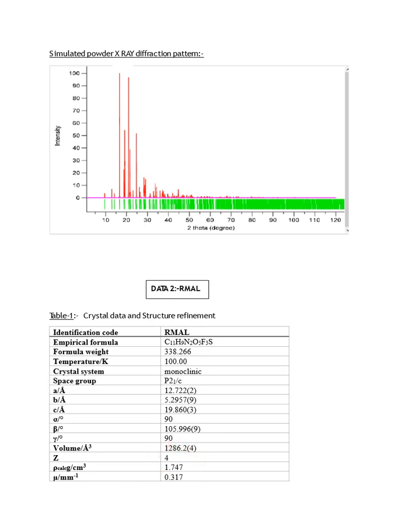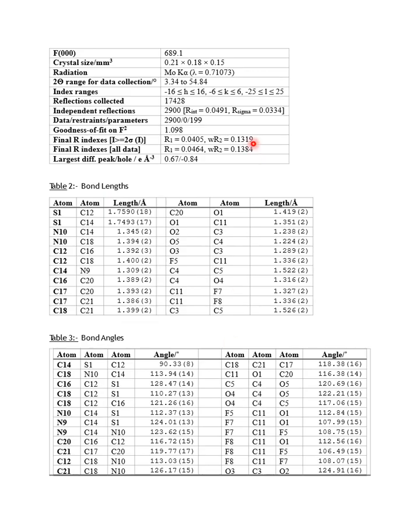There are 4 atoms per unit cell, and here also we use molybdenum K alpha radiation. The corresponding wavelength is 0.71073 angstrom, and these are the numbers of reflections collected during the XRD detection, and this is the table for the bond lengths in the crystal structure, and these are the tables for the bond angles.